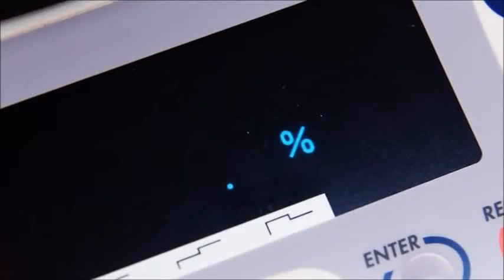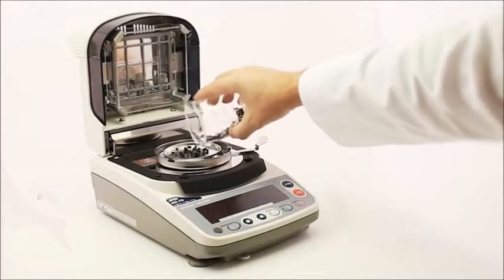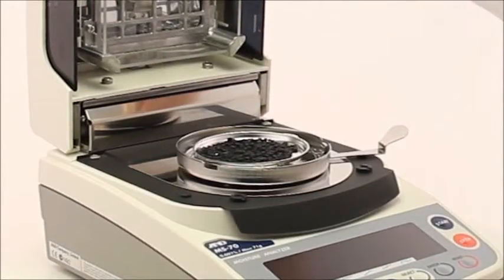The model MS-70 measures down to 0.001% moisture content with its resolution of 0.1 milligrams. Now, even challenging low moisture substances like plastic resins can be conveniently characterized.